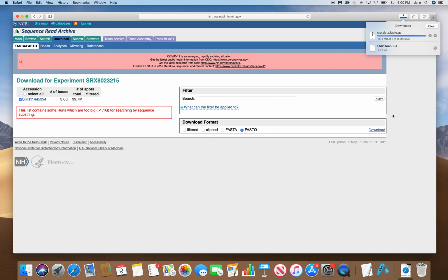So don't be discouraged. Whenever we continue to work in the space, I would encourage everyone to get rid of as many files as you're not using as possible, because it will make data management a little bit easier. What I want to avoid is people having terabytes of space on their computers just clogged up. So what we'll be doing is downloading small data sets, processing them on Galaxy, summarizing them, and then y'all will be sending me the results for that, and then you'll be able to wipe your machines, and you'll be able to do the next set and the next set and the next set.